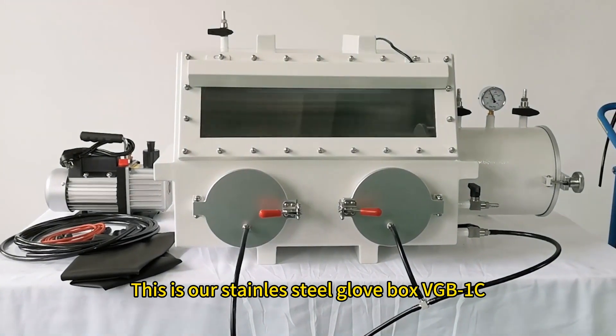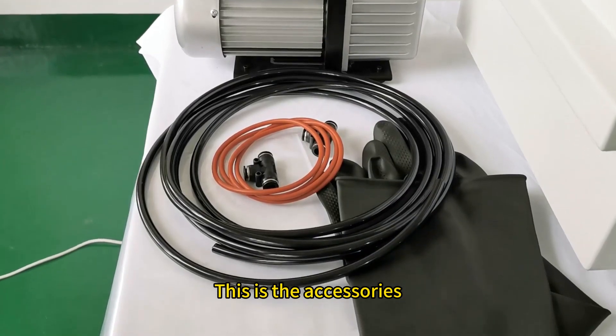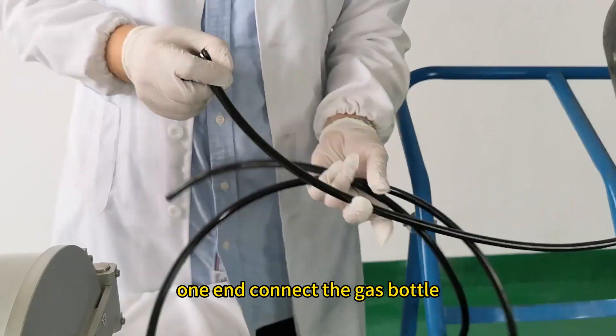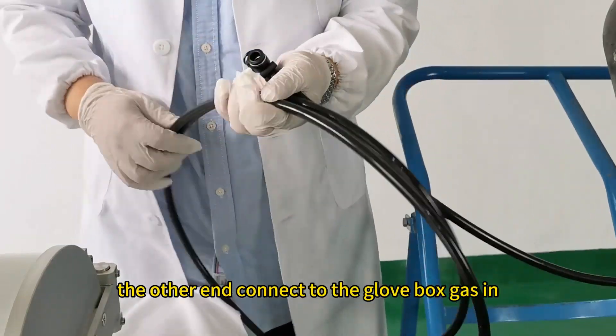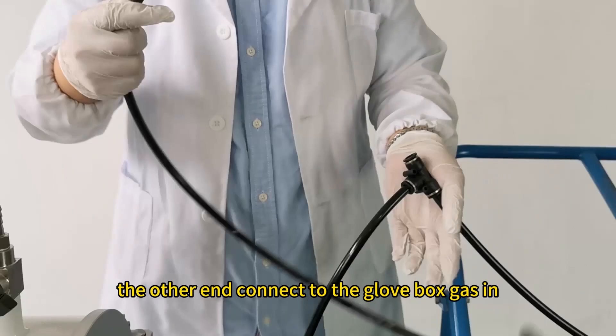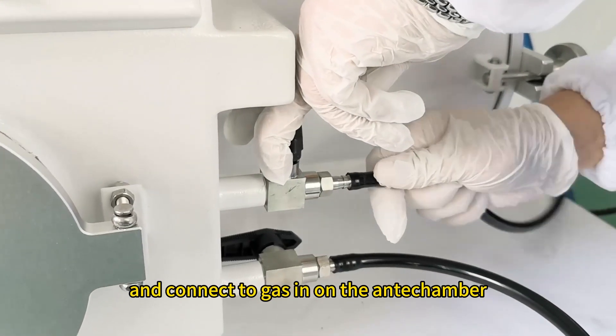This is our Stainless Steel Glovebox VGB-1C with 3 accessories. First, install a pipe: one end connects to the gas bottle, the other end connects to the glovebox gas inlet. Then connect to the gas inlet on the antechamber.